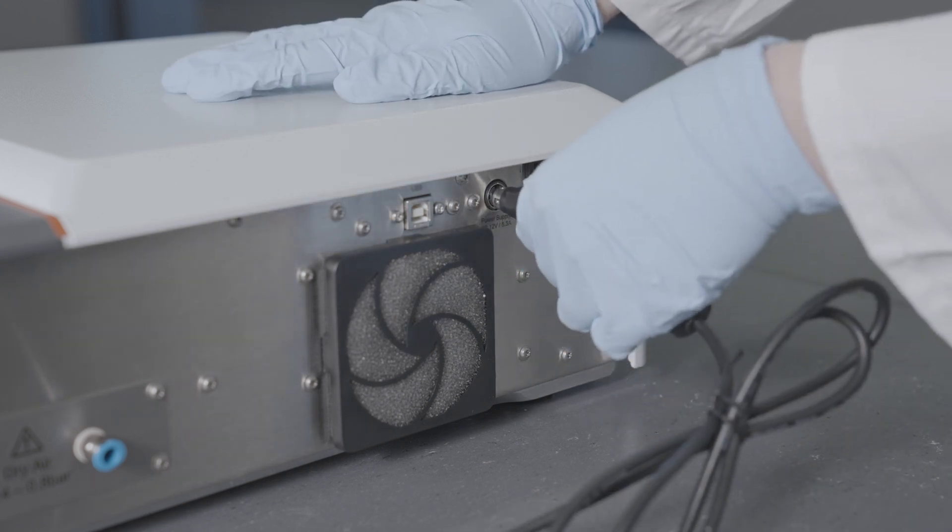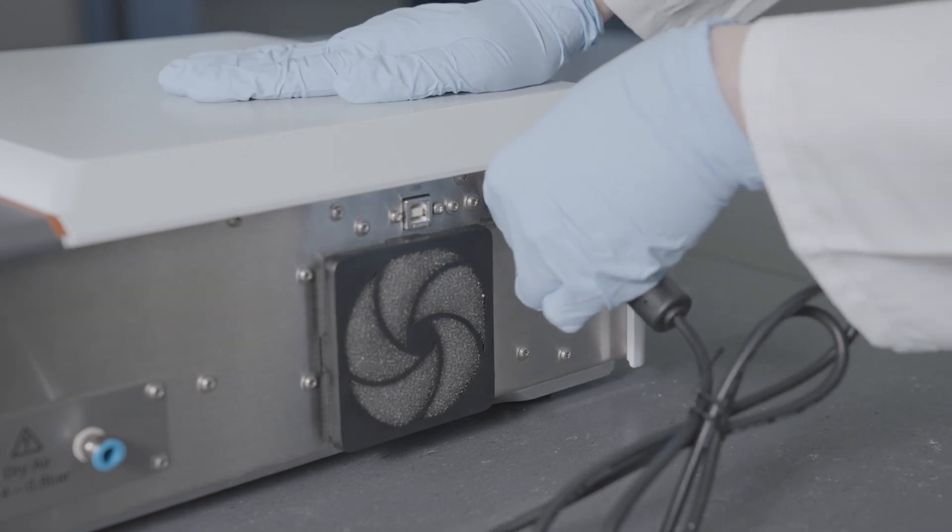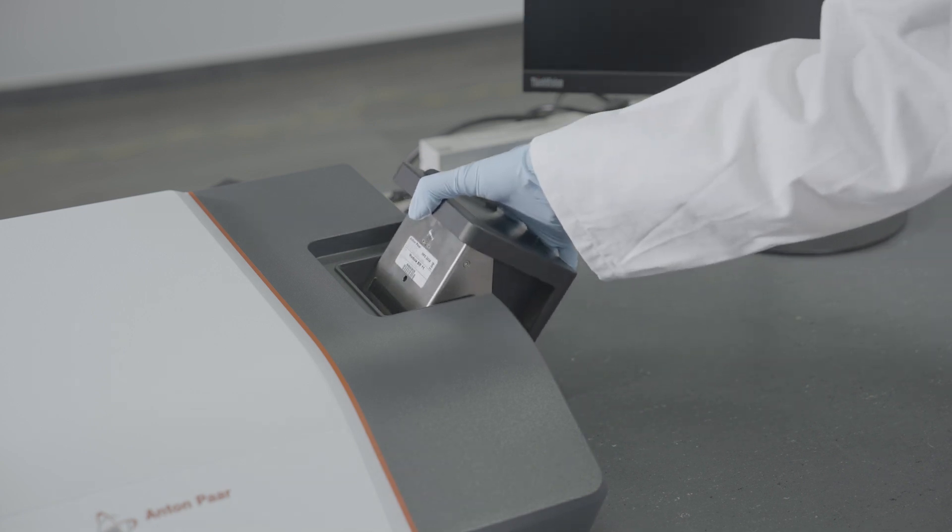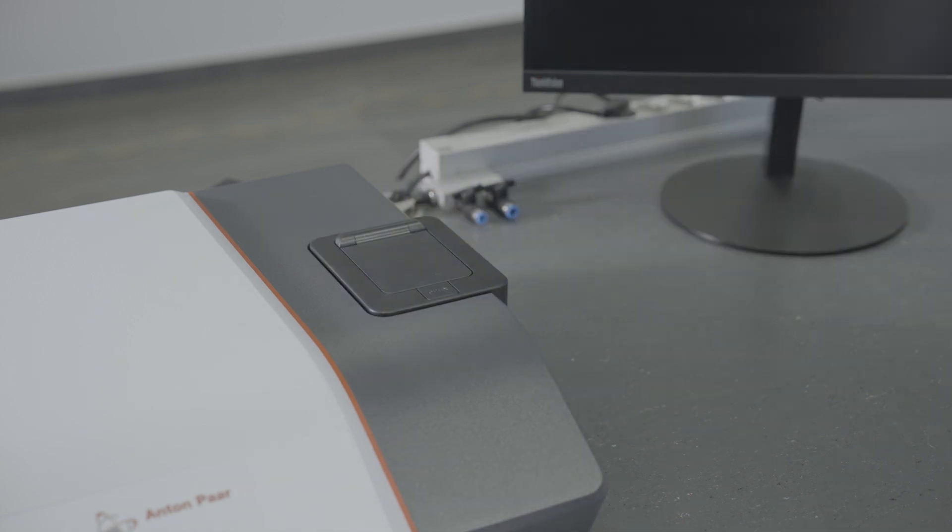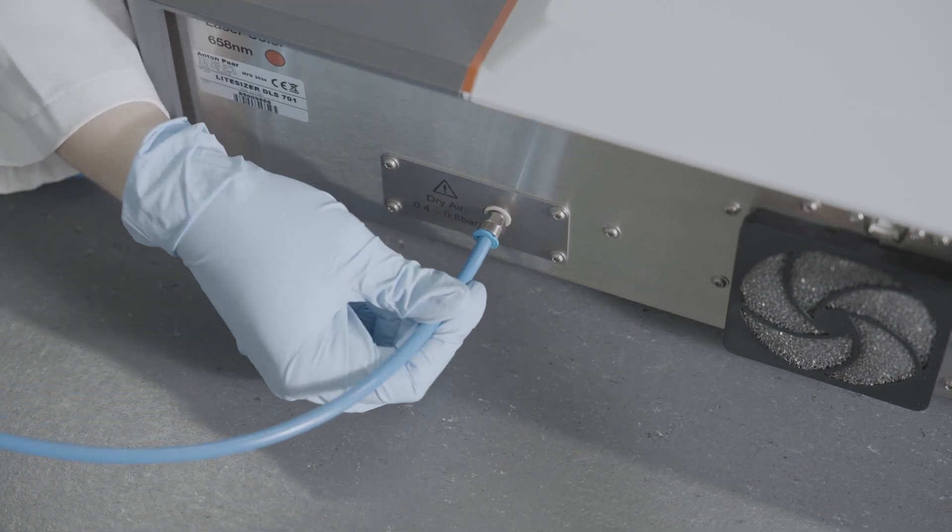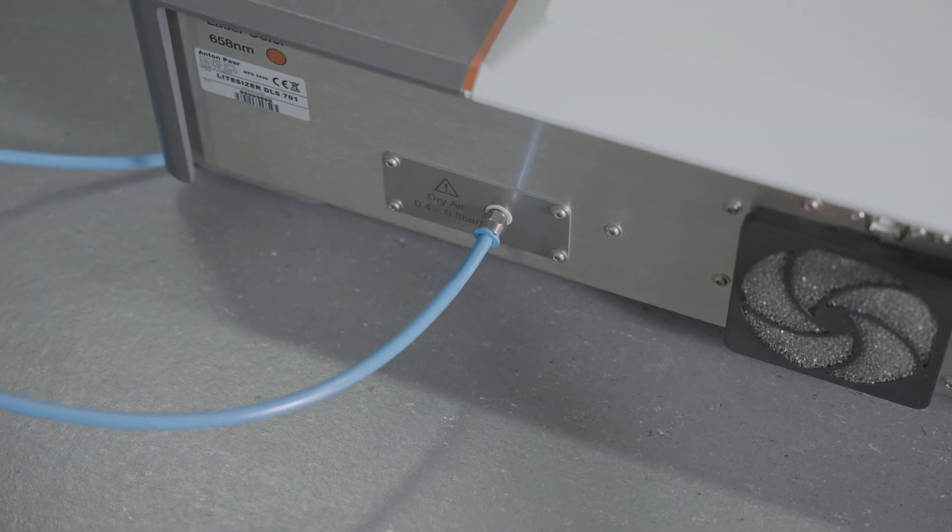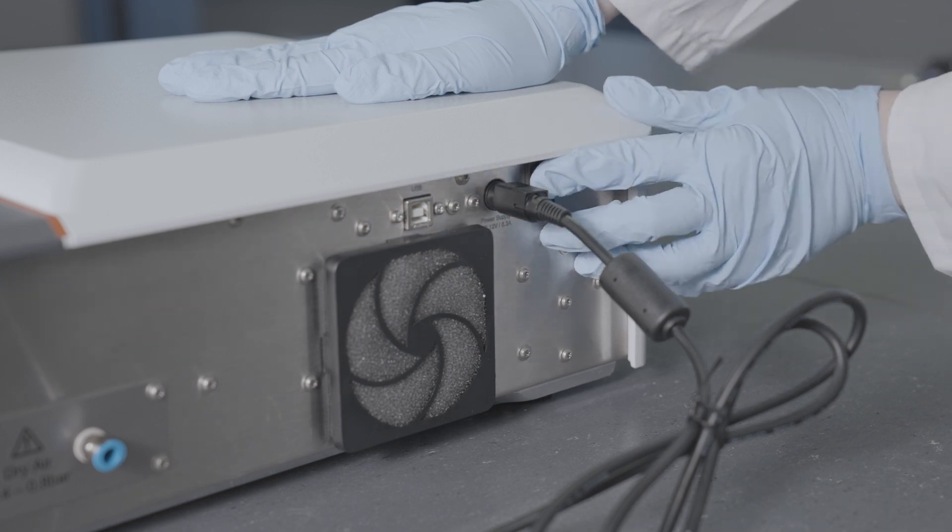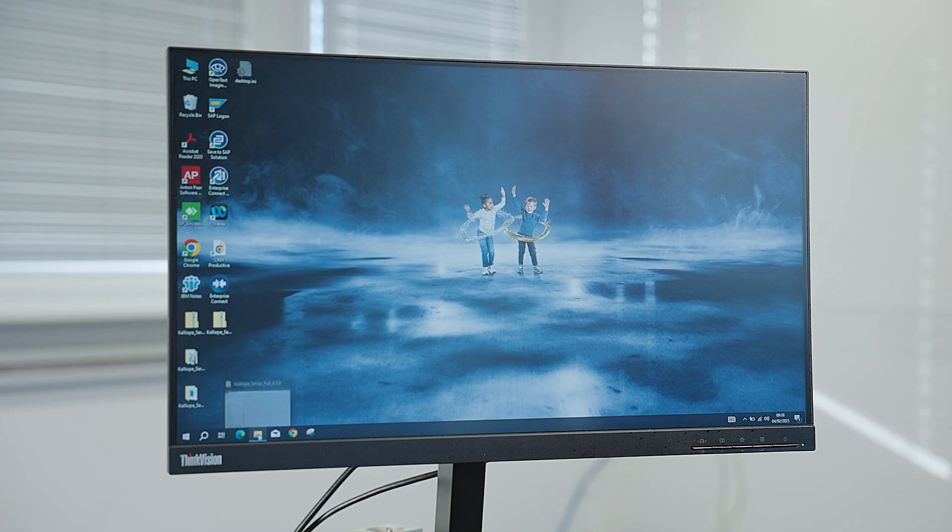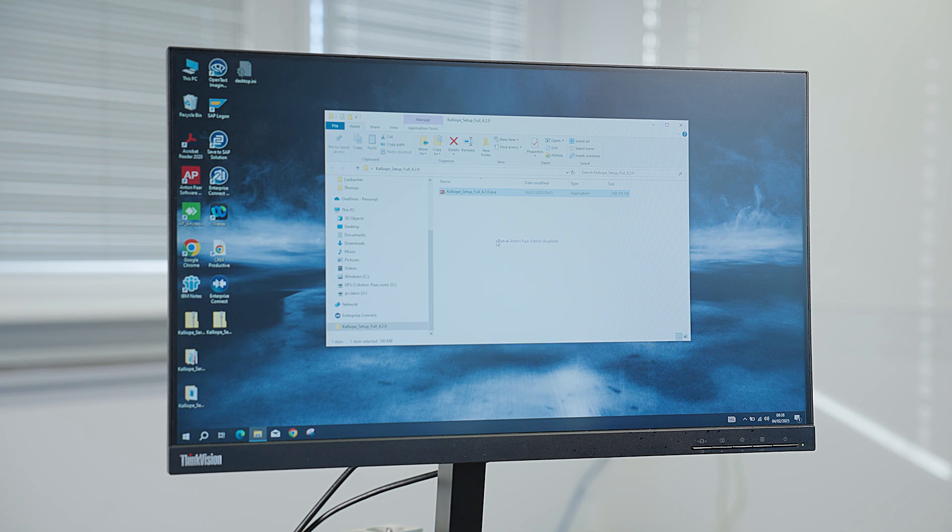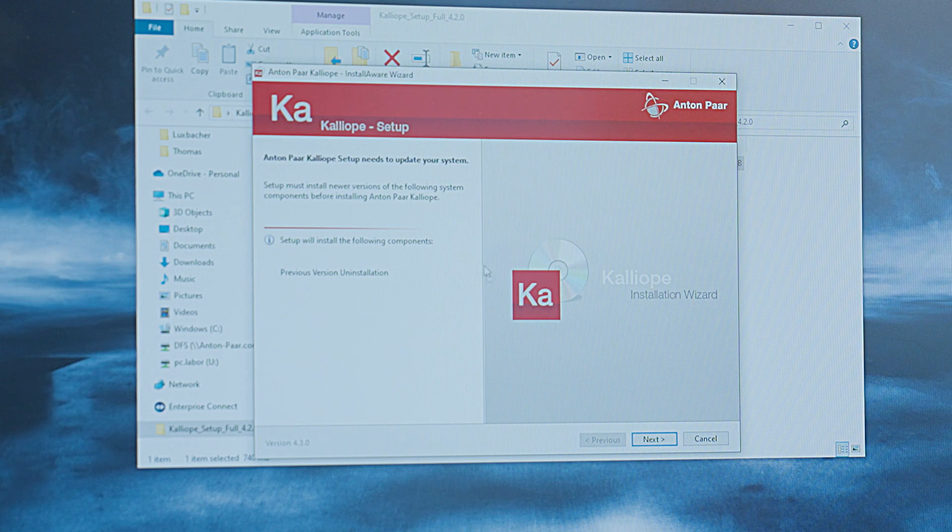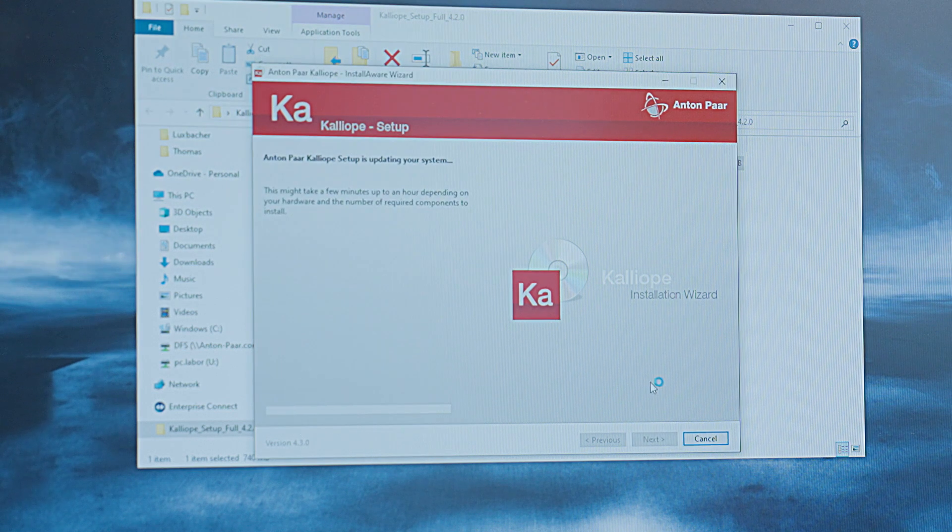Attach the power cable to the power supply and connect it to the instrument. Insert the module, attach the pressurized air purge, and turn on the power switch. The LightSizer DLS is operated by the workflow-based software Calliope. After attaching the USB cable to connect the instrument to the PC, install Calliope from the provided USB stick.